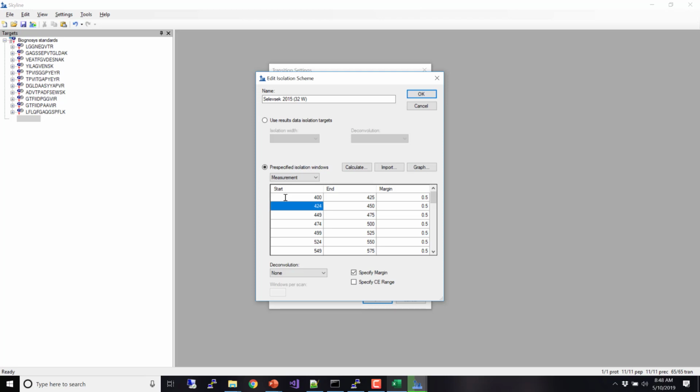Yeah, that's where you shift it to a dead zone. So you have the ability to choose optimized window placement, which is what gets done in the MacLean lab a lot, especially because it's important to the overlap and the demultiplexing. But if you're using margins, this is more the Aebersold lab way: wider windows with margins, no overlap, and now we're seeing variable windows and everything. The MacLean lab way is dead zones with demultiplexing, but this is Aebersold lab data. So click OK.